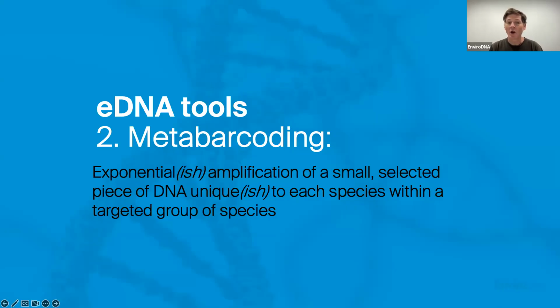There's kind of a blur between multiplexed qPCR assays where you might be targeting a few groups, less than 10 probably. You can have relatively specific metabarcoding assays sometimes, although more generally their use is in broad scale monitoring where you don't really know what you will be finding, perhaps in a biosecurity context or a biodiversity and conservation context where you are perhaps less interested in the taxa you're finding and more in other higher order metrics derived from this data.